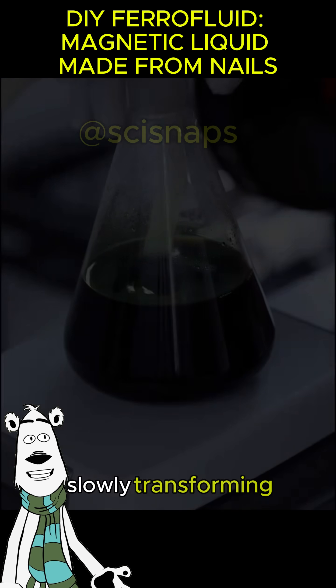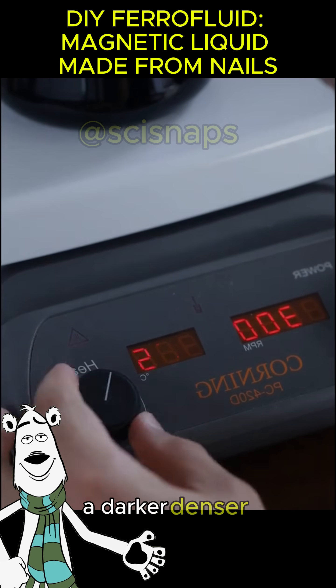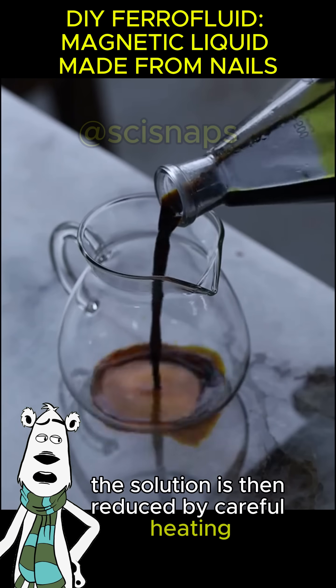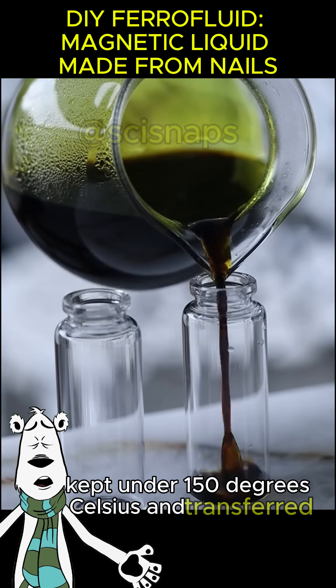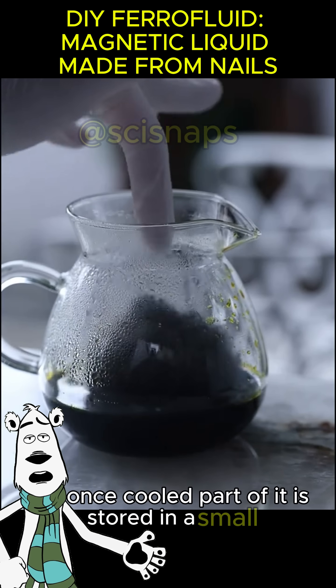Heat slowly transforms the ferrous chloride into ferric chloride, a darker, denser form. The solution is then reduced by careful heating, kept under 150 degrees Celsius, and transferred into another container.